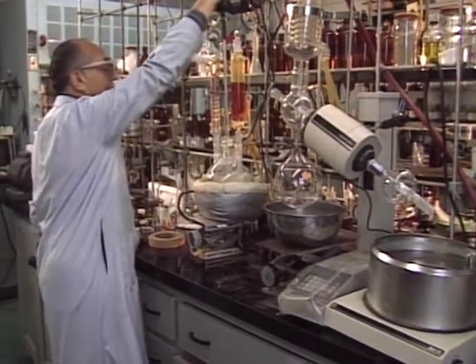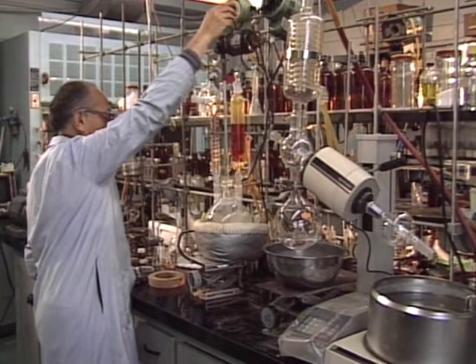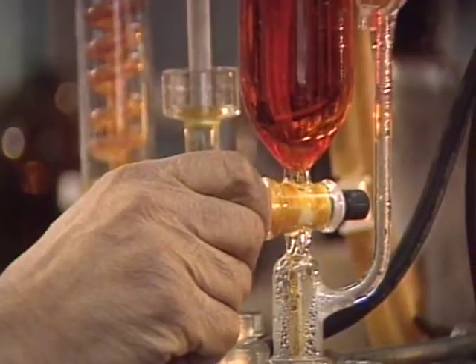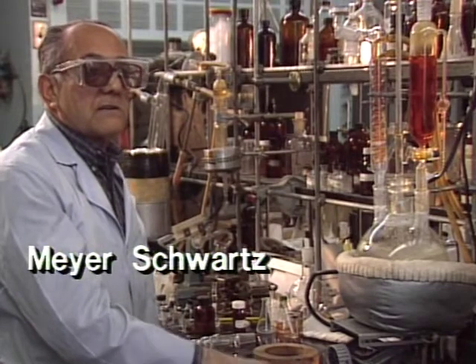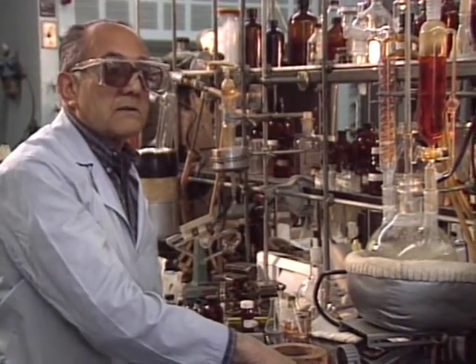What I'm doing here is converting an alcohol to a bromide, which is going to be the starting material for one of our syntheses of an insect sex pheromone. This requires purification and distillation and verifying the structure by infrared spectroscopy and other means.